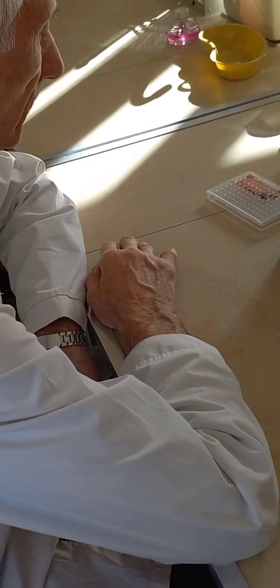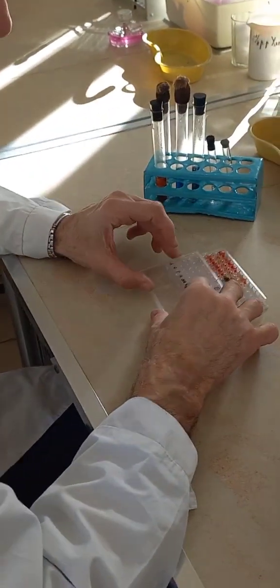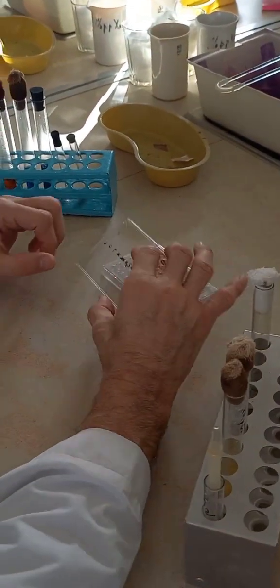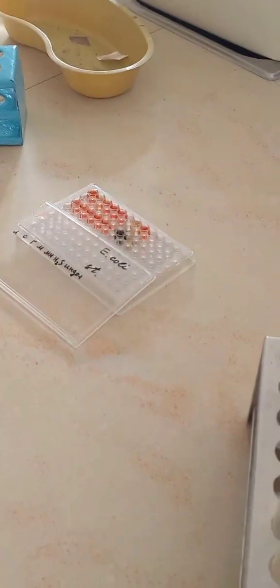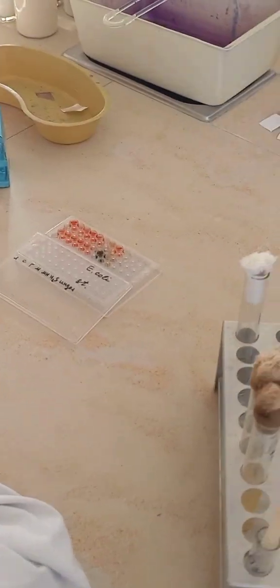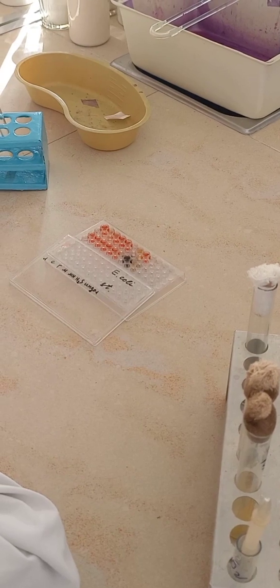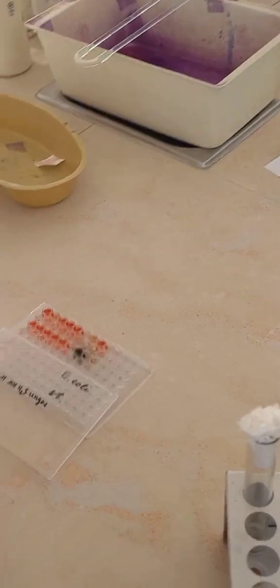Next moment, people. The basic one, this is evaluation of carbohydrate fermentation and proteolytic activity. My standard question. Also not allowed to open this way, but I will make that better visible. How many colors do you see here? Three colors. I think everyone recognizes. Next question, people. What was the initial color of the medium? Yellow. And that's why, people, you see only three were not changed.